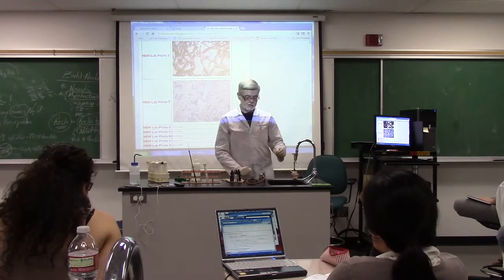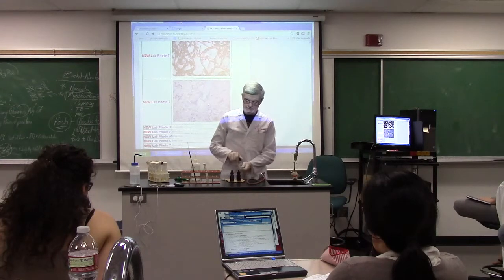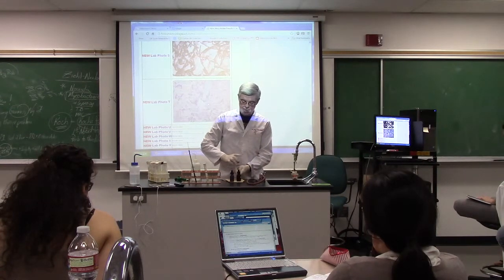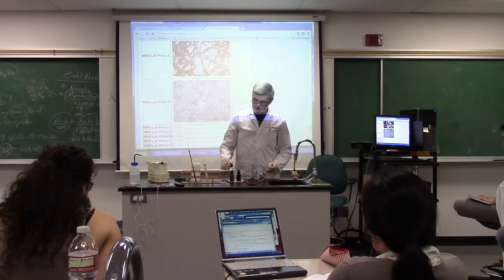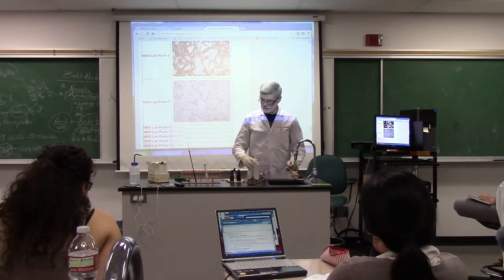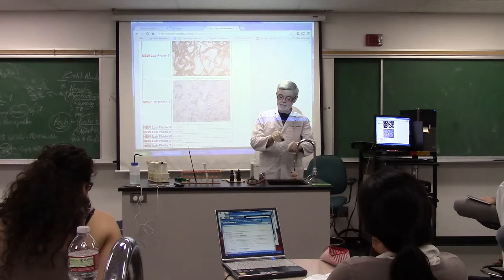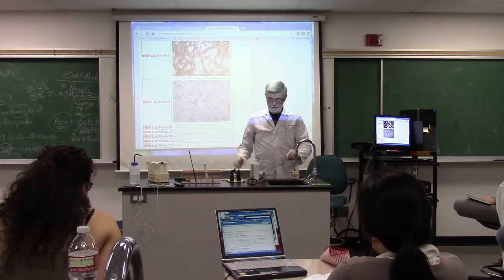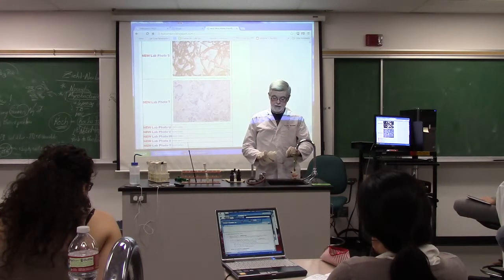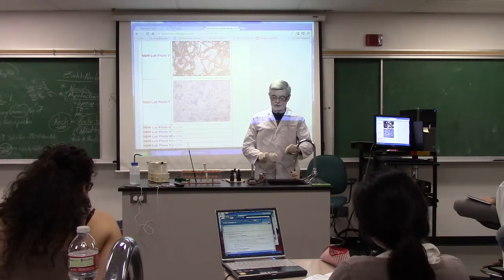So after it begins to withdraw, we're going to shake it off. We're going to get this acid alcohol. We're going to get a half a dropper full, ready to go. Get our water ready to go. Don't get the disinfectant. Okay, and I'm going to aim above it. Shake and wash. And you'll want to wash the back side, but not at the circle, just around it.